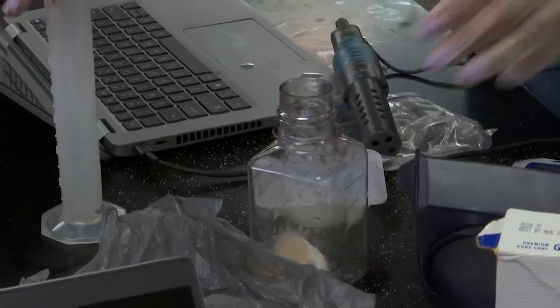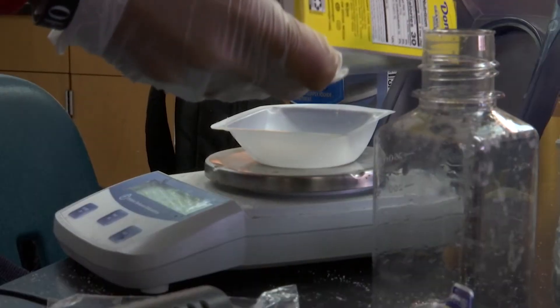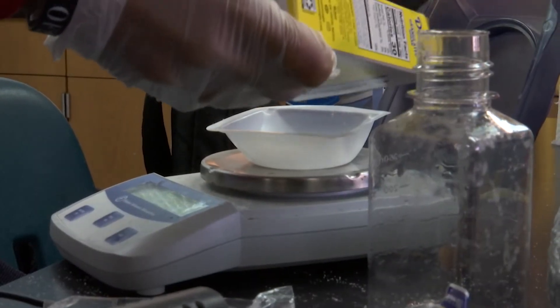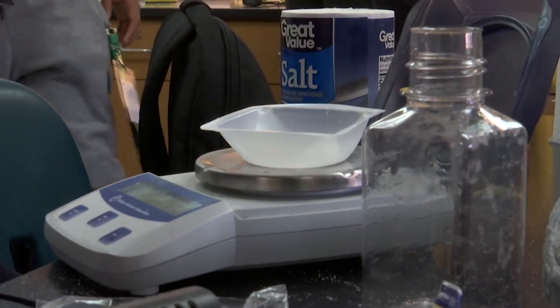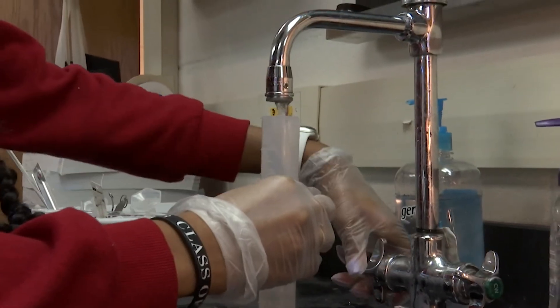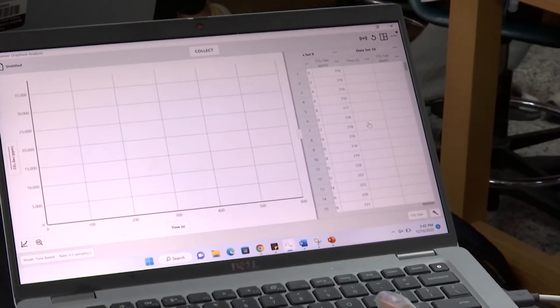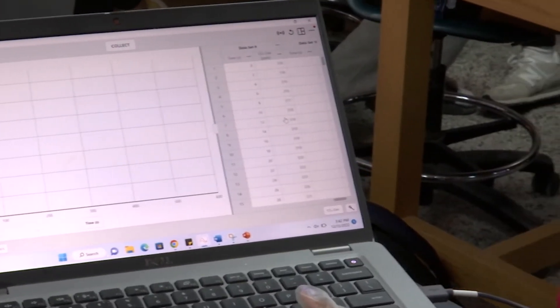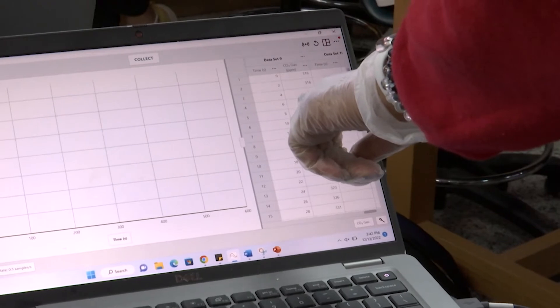I'm measuring the rate of sucrose concentration and how it affects the rate of fermentation on yeast — essentially, if you are baking, how much sugar and yeast mixed together would make the bread rise. Over here you'll see the different ones when they start.